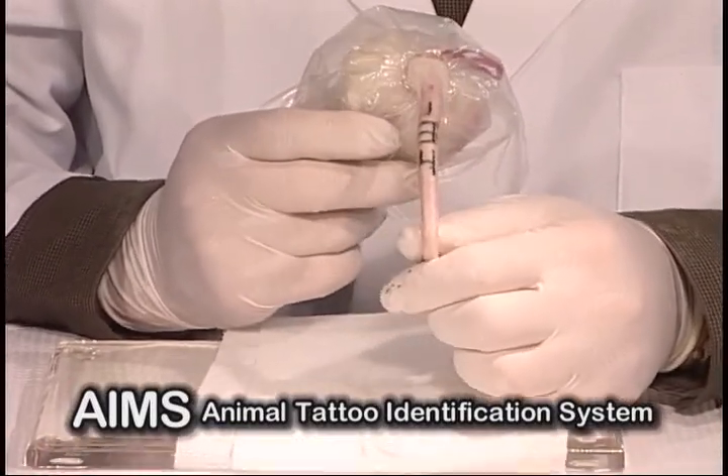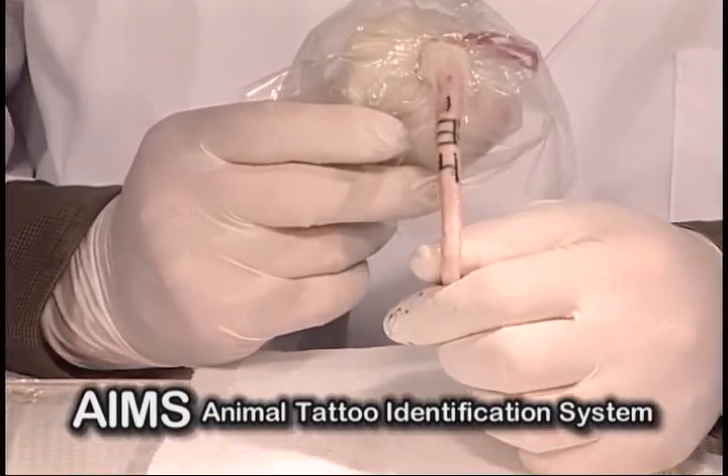One, three, four. Now you have a permanent tattoo on your animal for your identification.